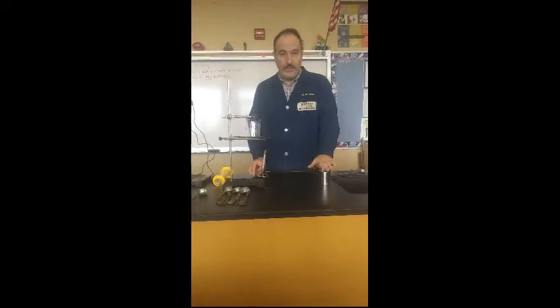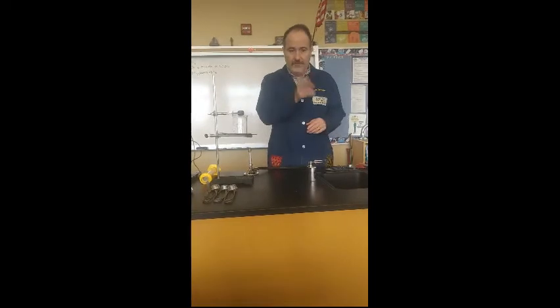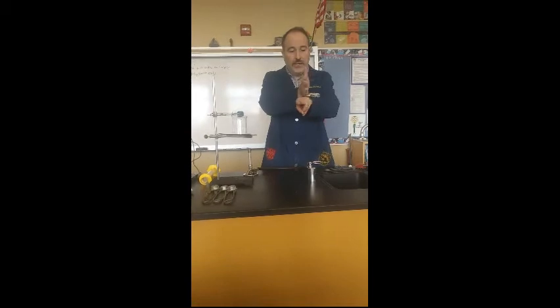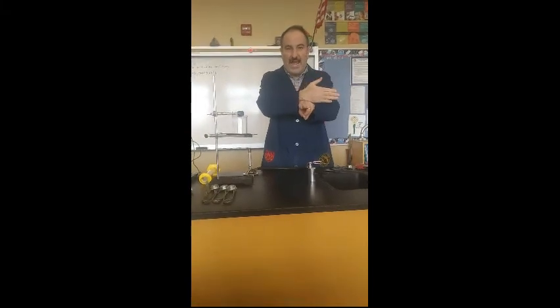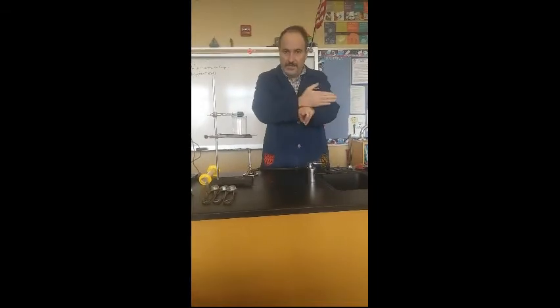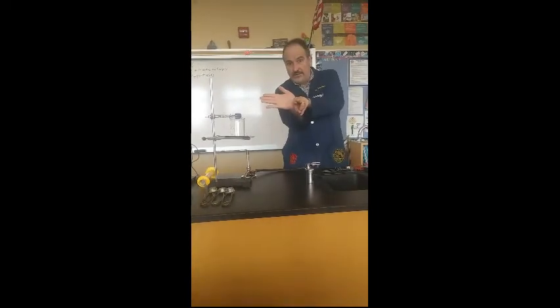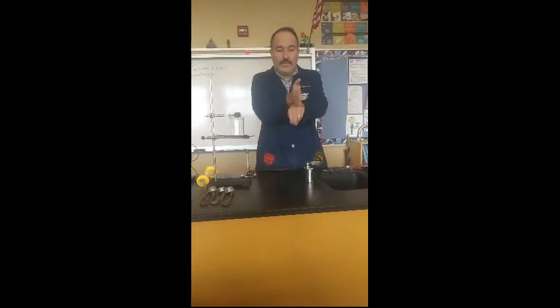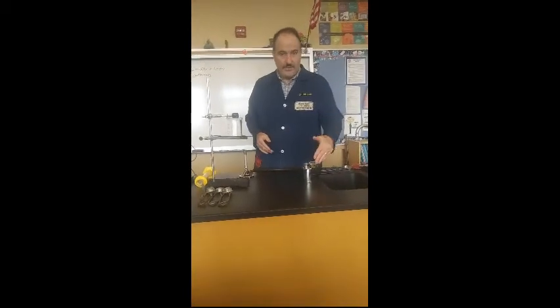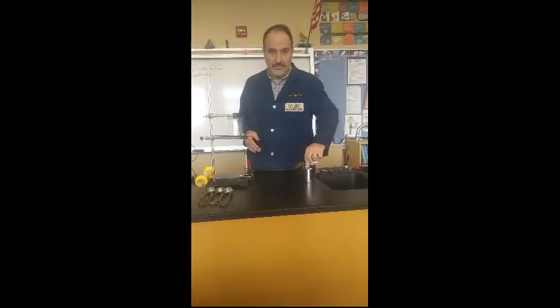Oh, and by the way, a quick word about the gas valves. The gas valves, basically they have the nozzle with the hose that goes onto the nozzle. And then on top, they have a little flag handle. Now, it is off when the flag is perpendicular to the nozzle, either side. So this is off, that's off as well. On is when it is perfectly parallel to the nozzle. So if you can see here, this is off, that's off, that's on, okay?